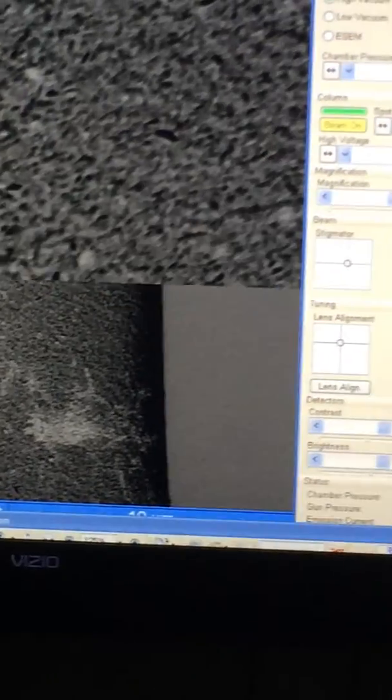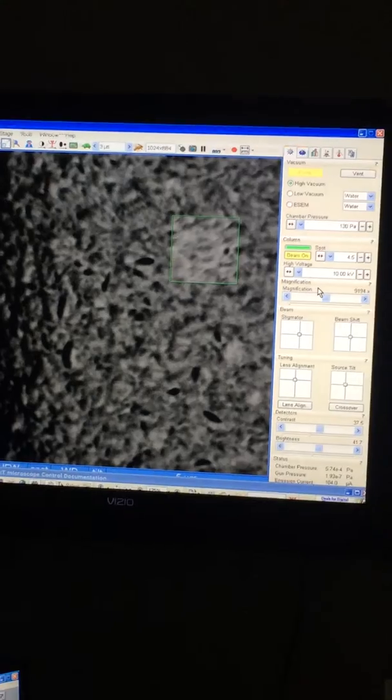And zooming in, as I say, you can see. Let's see, we need to go to a faster scan by having a smaller area. And so, what is this image telling you as I go through focus here? Astigmatism, because you're getting this bad distortion.